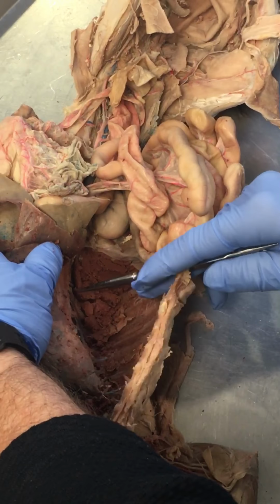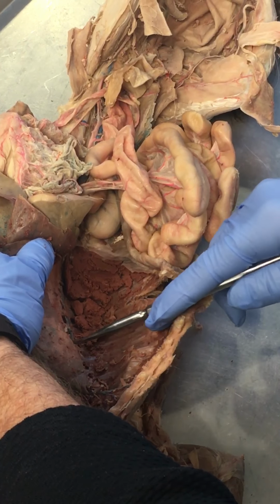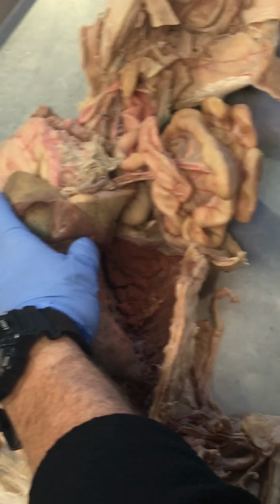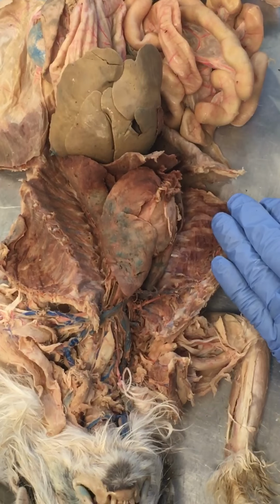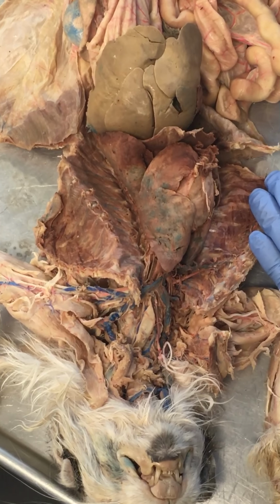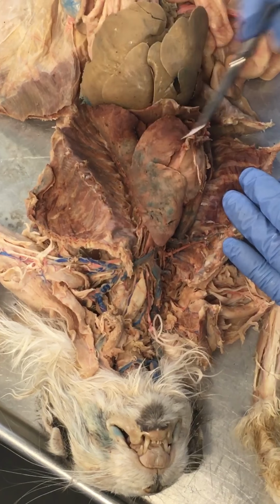So the aorta comes down like this on the left side. Azygous comes down the right side. These are still the red ones. Those are still intercostal arteries coming over to the right side of the chest wall. Internal mammary, we already talked about those veins. They're going to run with the internal mammary artery, right? Vertebral veins, we're not going to worry about those. Brachiocephalic veins, we said before, this is brachiocephalic vein on the right side, brachiocephalic vein on the left side right there, okay?